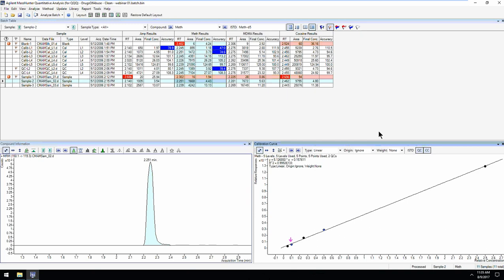Okay. Can you rename a user-defined column in MassHunter? Yes. We have several ways to name the user-defined column that's available. We can also put user-defined information in our sequence or our work list in the acquisition modes.